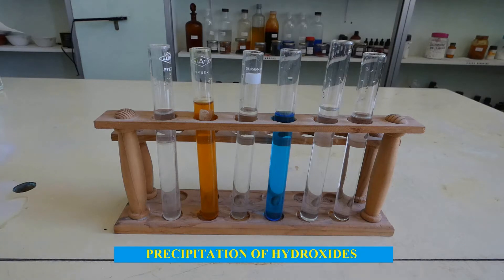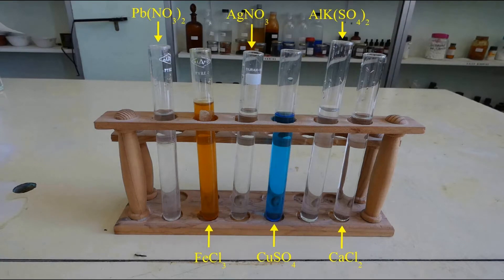We are going to do the precipitation of some hydroxides. In six test tubes dissolve lead nitrate, iron chloride, silver nitrate, copper sulfate, aluminum and potassium sulfate, and calcium chloride.